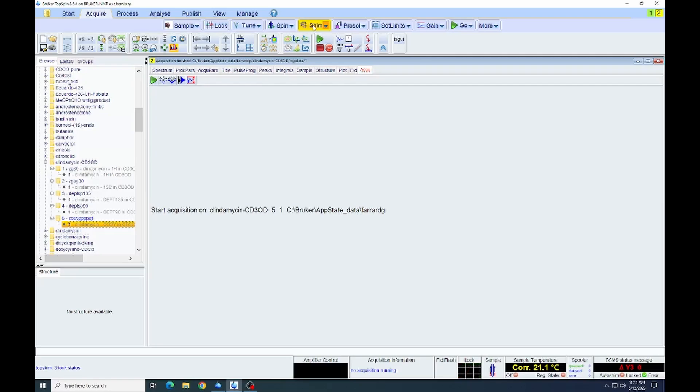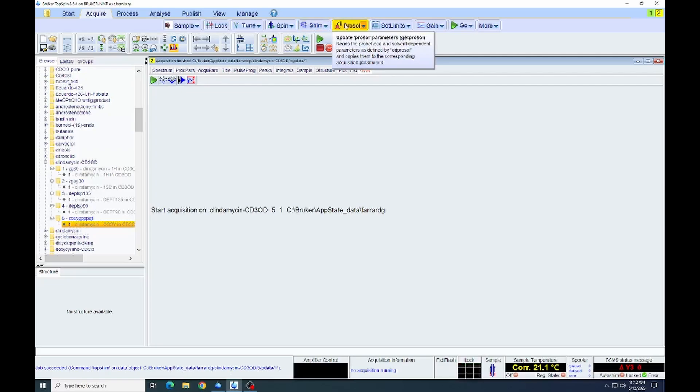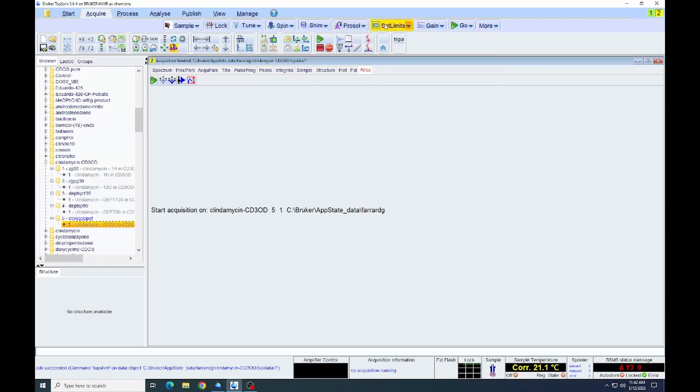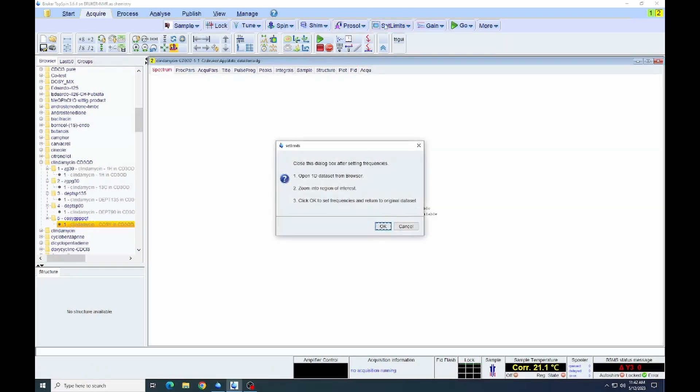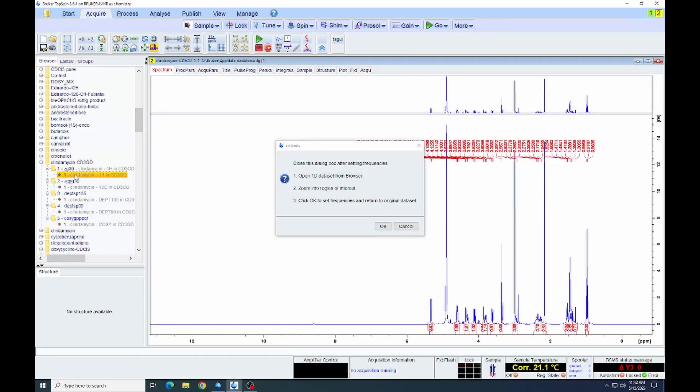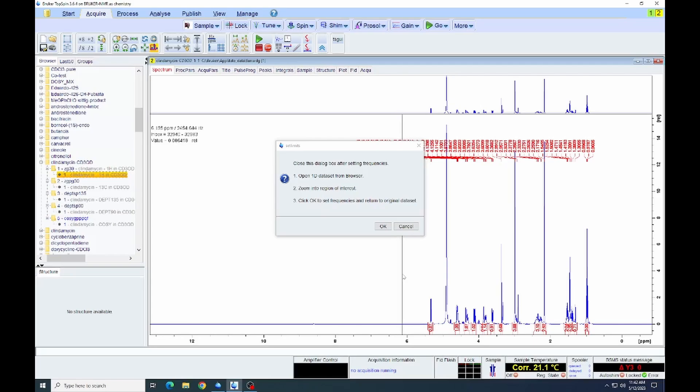With the shimming and tuning done, we will then need to set up some of our parameters. The default is to have a fairly large spectral window. We're going to narrow that down. We can do so by clicking on the set limits button. And when we click on that, it will tell us to select a 1D spectrum. Click OK or double click on the spectrum that we're going to choose. And we see the 1D spectrum. We will then zoom in on the area of interest, specifically the area where we have the peaks.